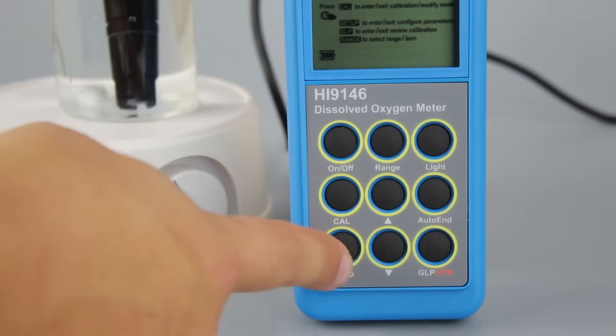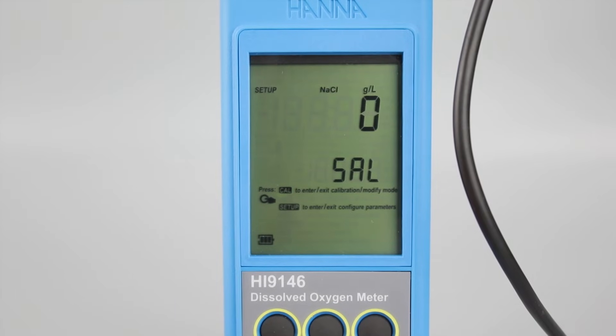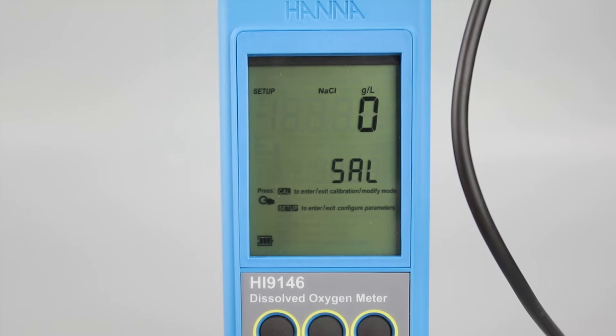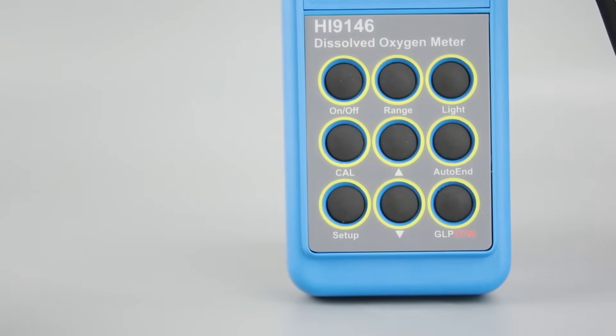By pressing the setup key, you can change a variety of settings. Simply use the arrows to navigate this menu and press CAL if you want to change anything. You can change salinity compensation, altitude compensation, date and time, beep status, instrument ID, backlight, auto-off settings, and the temperature units. To exit the setup menu, press Setup again.